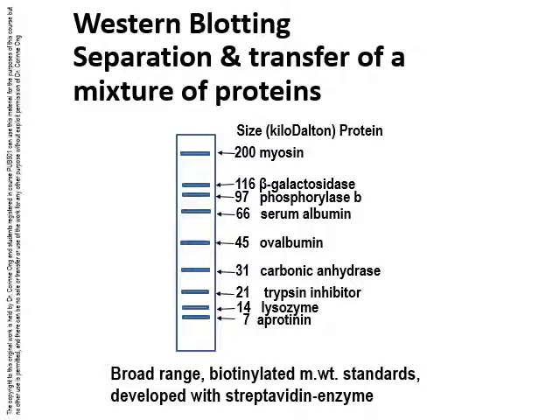Some of the markers also have special chemicals covalently bound to them so that they can be probed with the same reagents that are used in the immunoblotting procedure, such as biotin, which is used in the avidin-based enzyme detection reactions. I'll talk about that on the next slide.